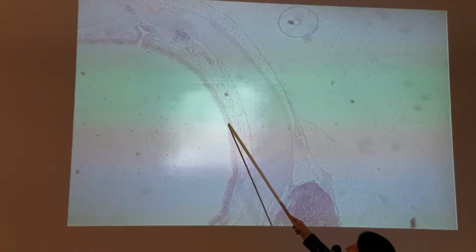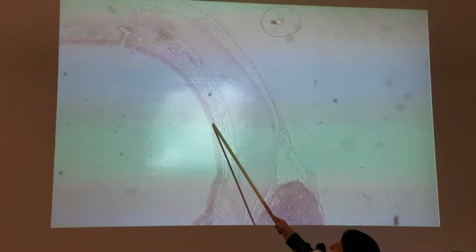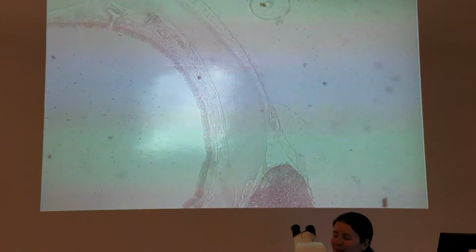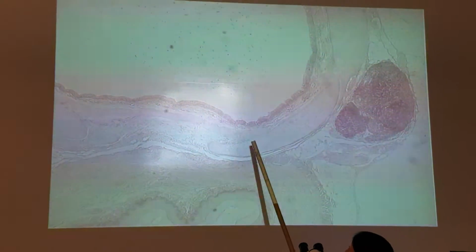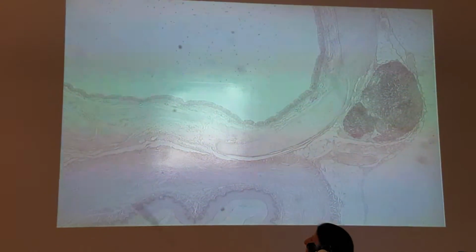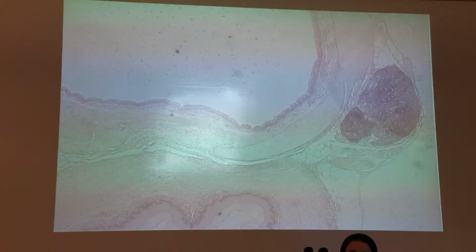So perichondrium, hyaline cartilage. What was this? Was it lamina propria, PSCCE, and at the bottom it was the trachealis muscle. There we go, trachealis. So this whole muscle looks like muscle. It is muscle. Trachealis muscle, all the way across. All right, so that's the trachea.